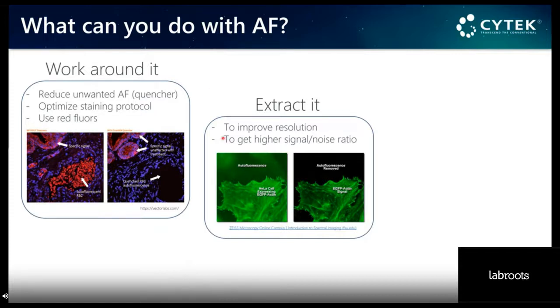Another option, once you have characterized or captured the light from autofluorescence and the light from your real fluorescence signal, in this case GFP, is computational removal of that background in order to get better resolution, better signal to noise ratio. That's what we call extraction of autofluorescence.